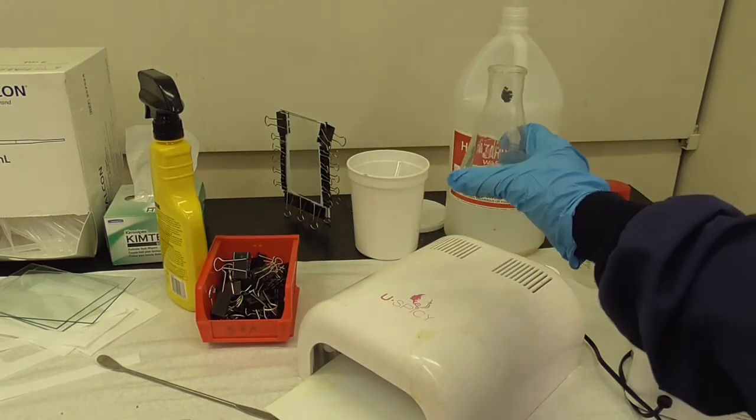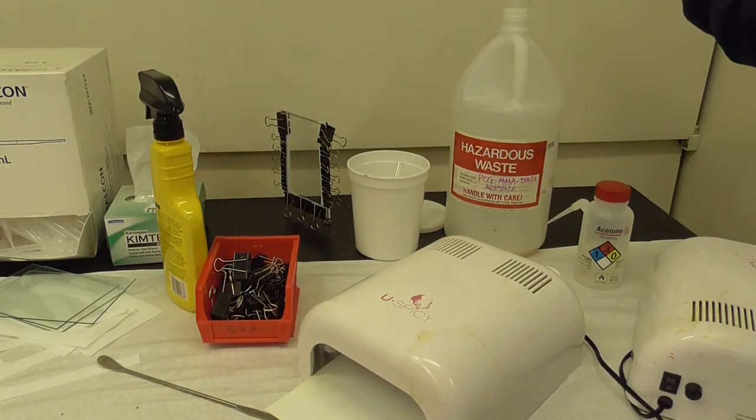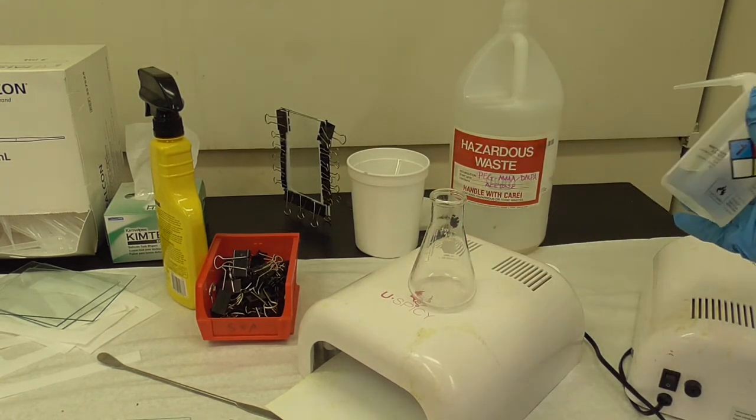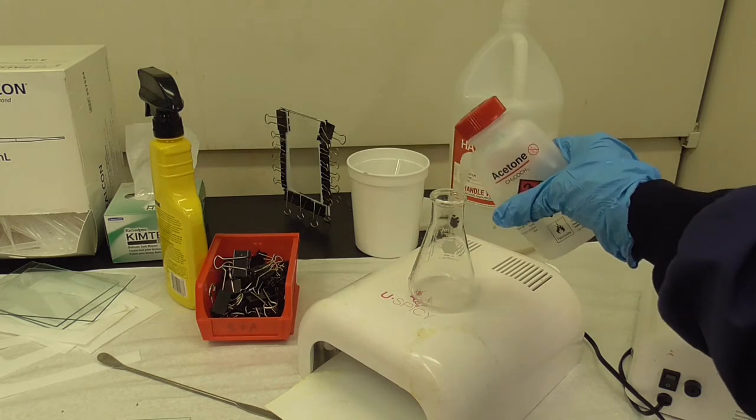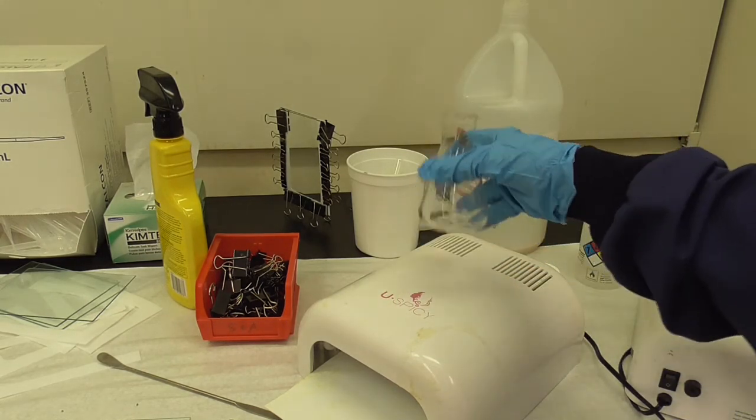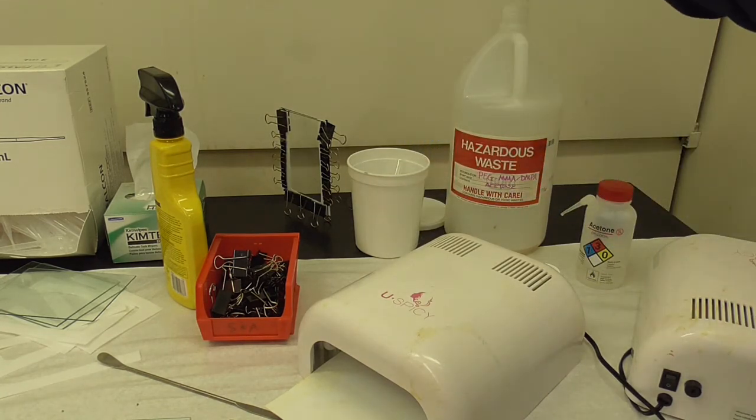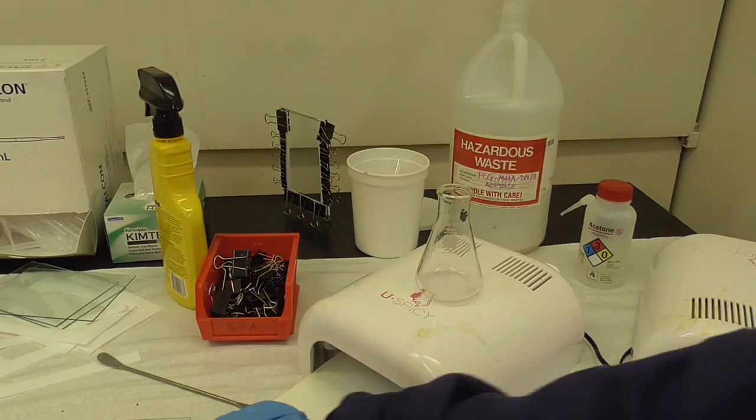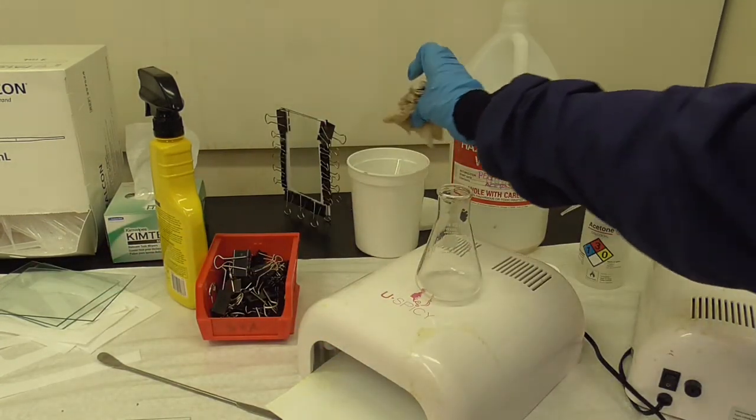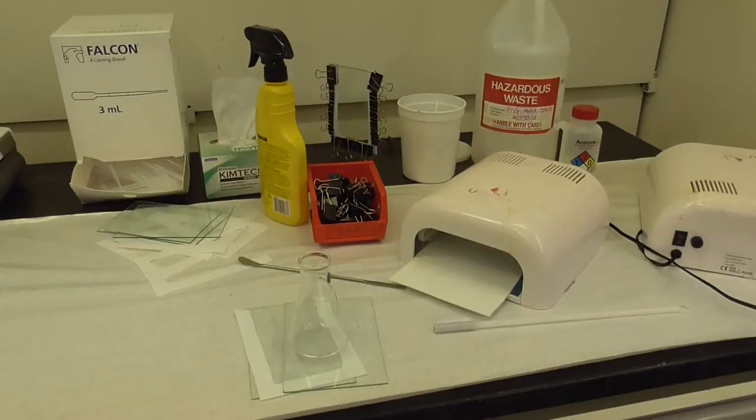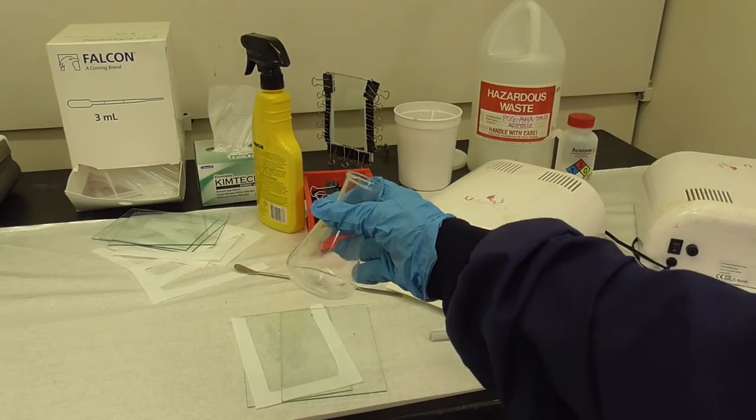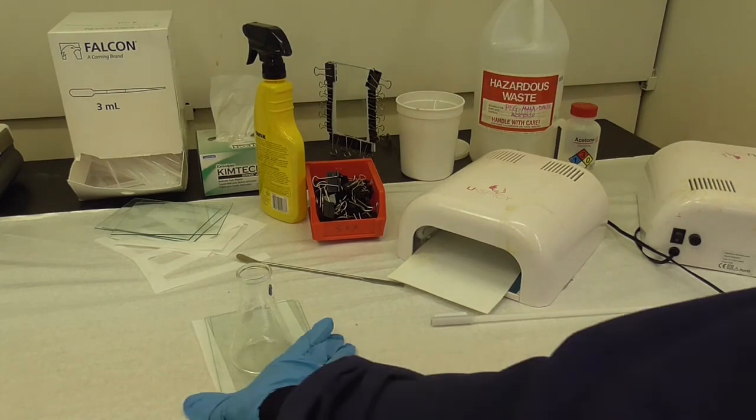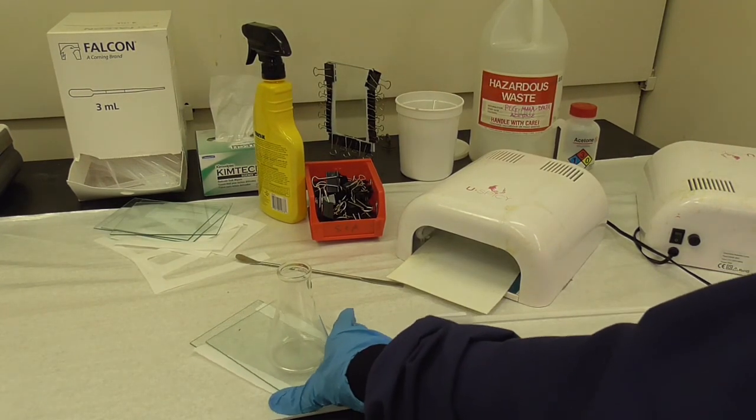And now we're going to pour this in the liquid waste. You can rinse out the Erlenmeyer with some acetone. Any solid waste you have goes in the little white tub. So then this rinsed Erlenmeyer along with the mold parts you put on the cart in the middle of the room for further washing by the teaching assistant.